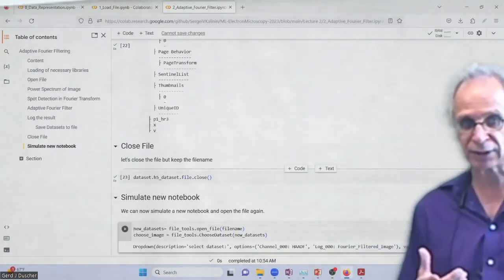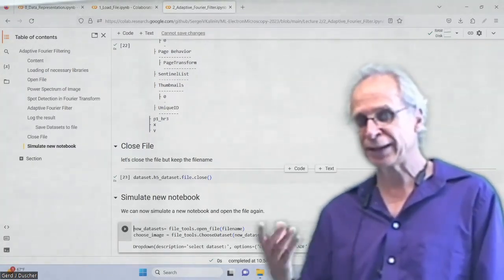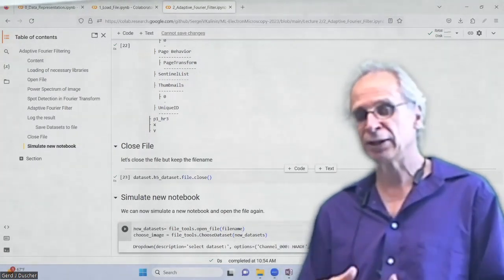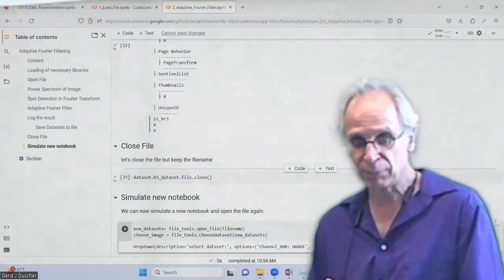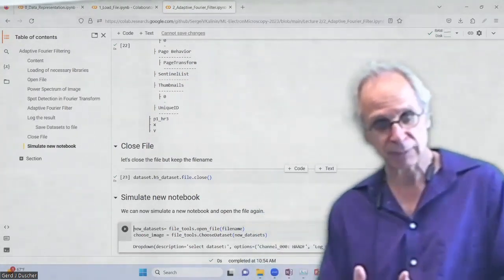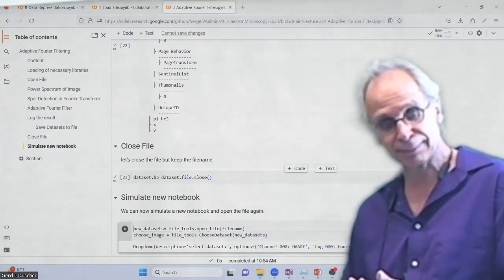So provenance is something in the analysis that got a little bit neglected. And so in microscopy, we really try to come up with good ways of keeping track of what we did to the data, when, in which order. Any idea of how to do it better, just talk to us, okay, please.